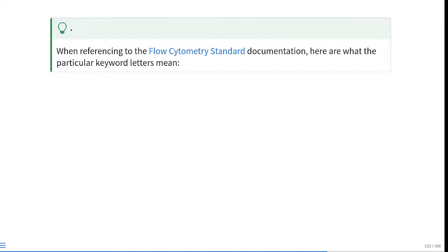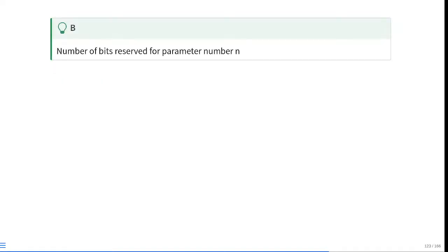If you went back and were actually curious enough to dive through and read through it all, if you had that time to kill, you could come back and figure out what these particular values correspond to. So in this case, B stands for number of bits. I'm not a computer scientist. This doesn't immediately make obvious sense. I vaguely understand what a bit is, but it doesn't seem to affect me on a daily basis, so I'm just going to skip over it.